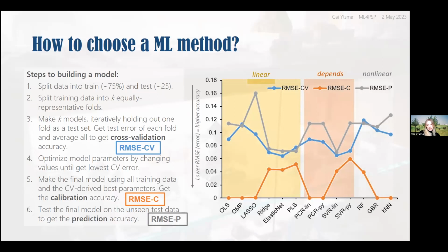We quickly see 2 trends in the results: those with big splits between the training, the orange, and the testing, the gray and blue errors, and those that have more agreement. So this first case is classical overfitting. You prioritize a low training error and you're going to get high test errors. We want something where the values are more in agreement.